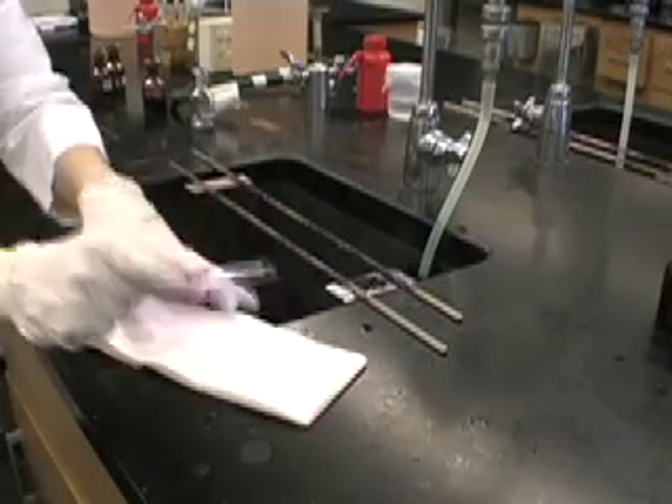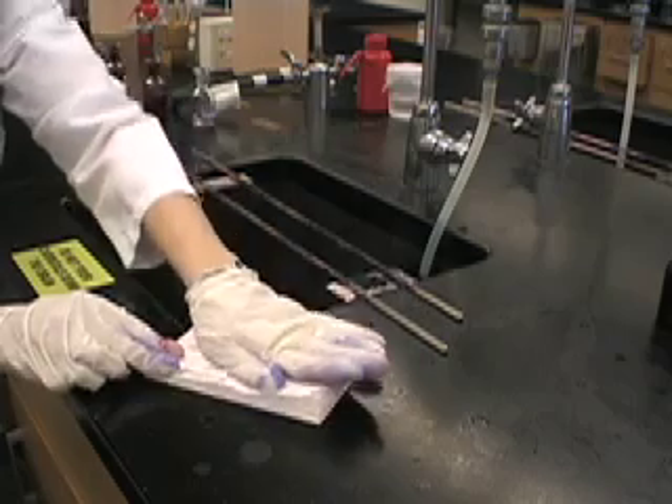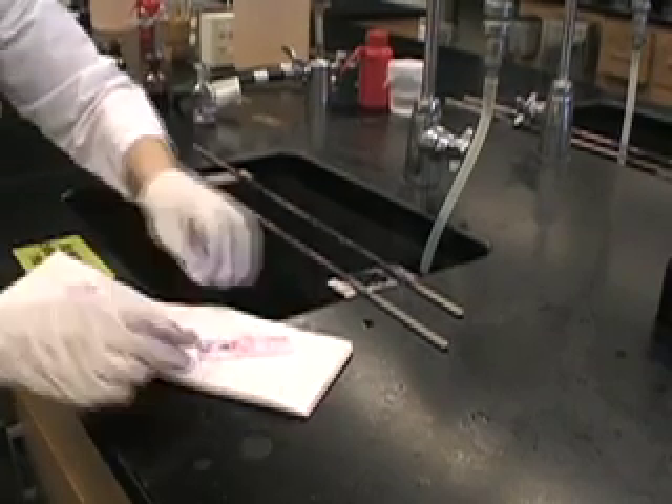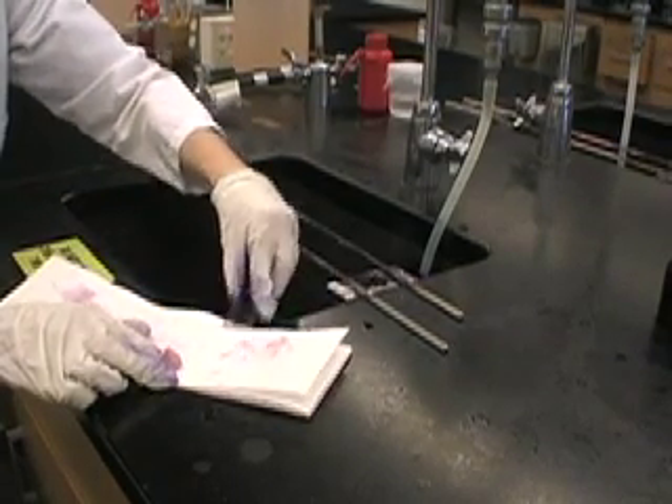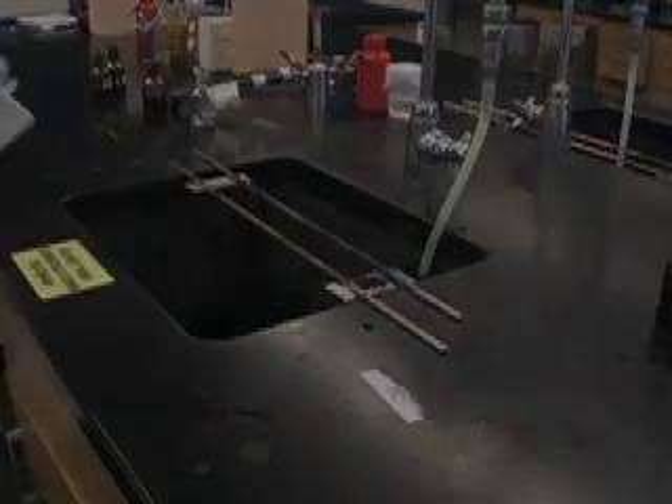Then you're ready to blot your slide dry by placing it in the book of bibulous paper and gently pressing it down. Now you can examine your slide.